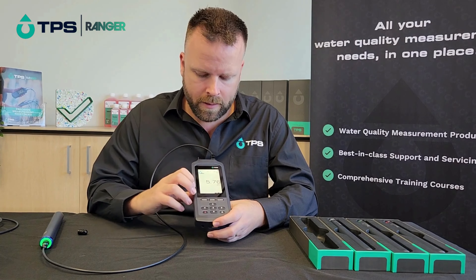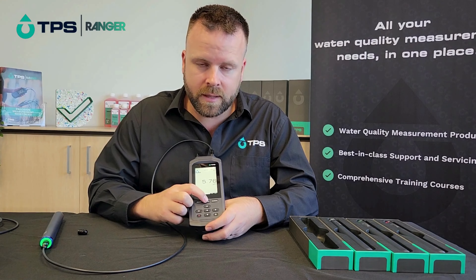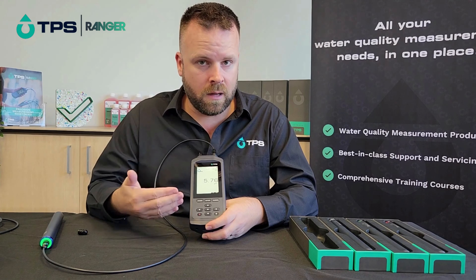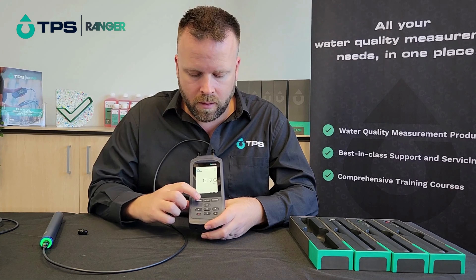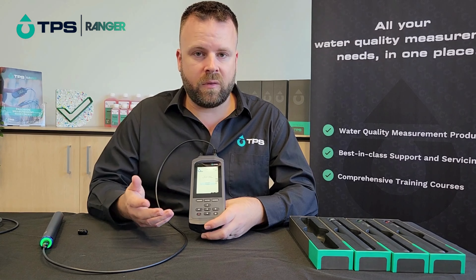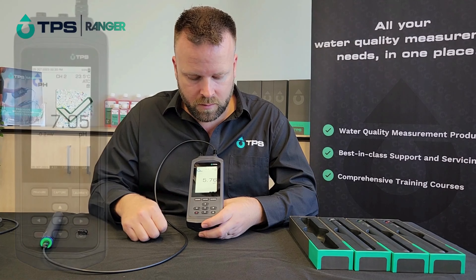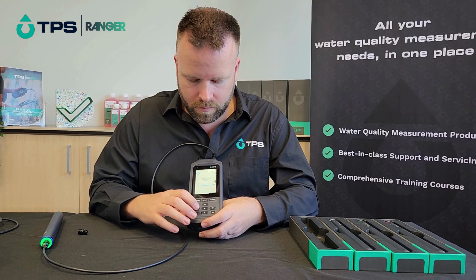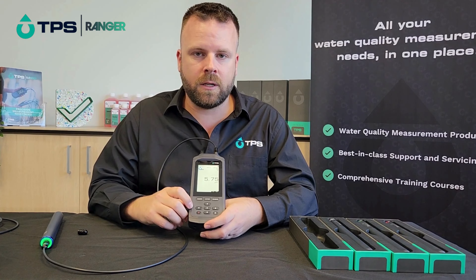We'll go back to the measurement screen just to show a couple of other things. We've got a capture button here — when we press it once, it captures the data that's live on the screen and we can download that later to the computer. If we hold that capture button down for a couple of seconds, it's going to ask us if we want to start data logging. We can confirm that, and a little icon comes up on the screen to show that it's actually data logging.